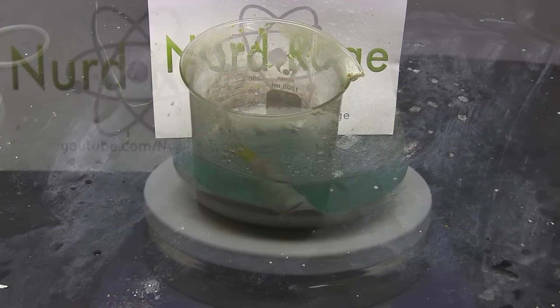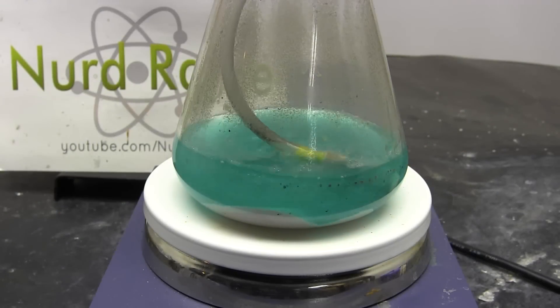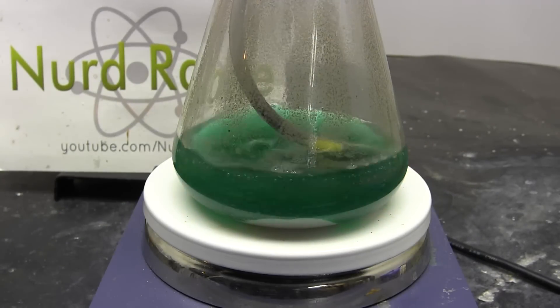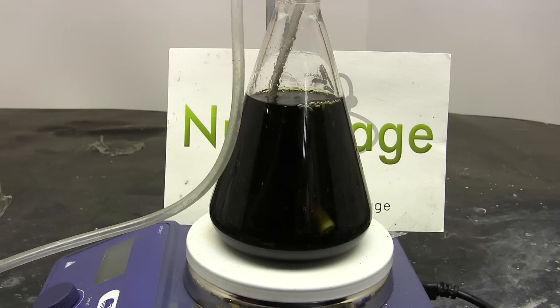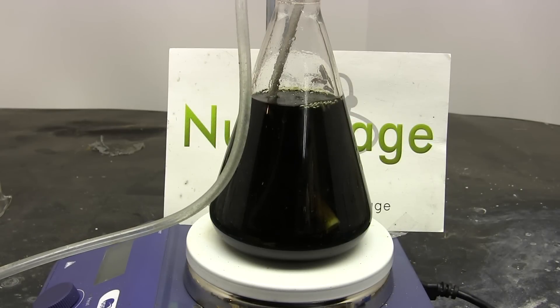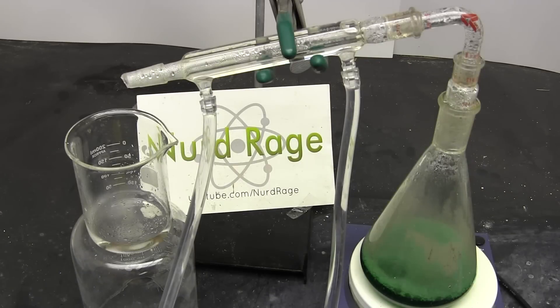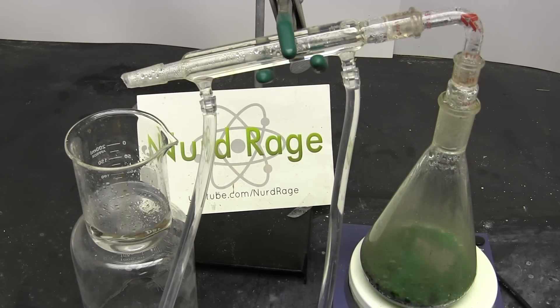Greetings fellow nerds, in this video we're going to recover the copper in a spent solution of ferric chloride printed circuit board etchant, as well as restore the ferric chloride etchant to working chemistry. And as an added challenge we're going to do so without producing any additional chemical waste.